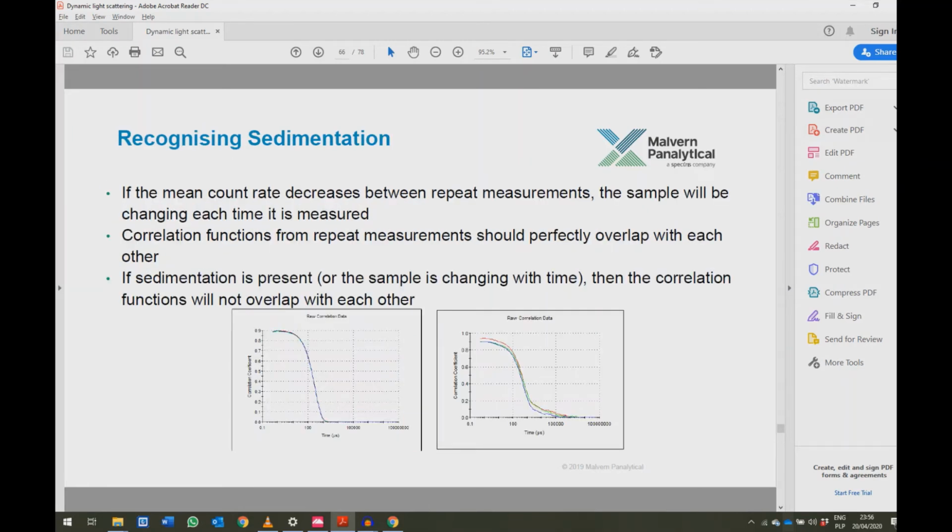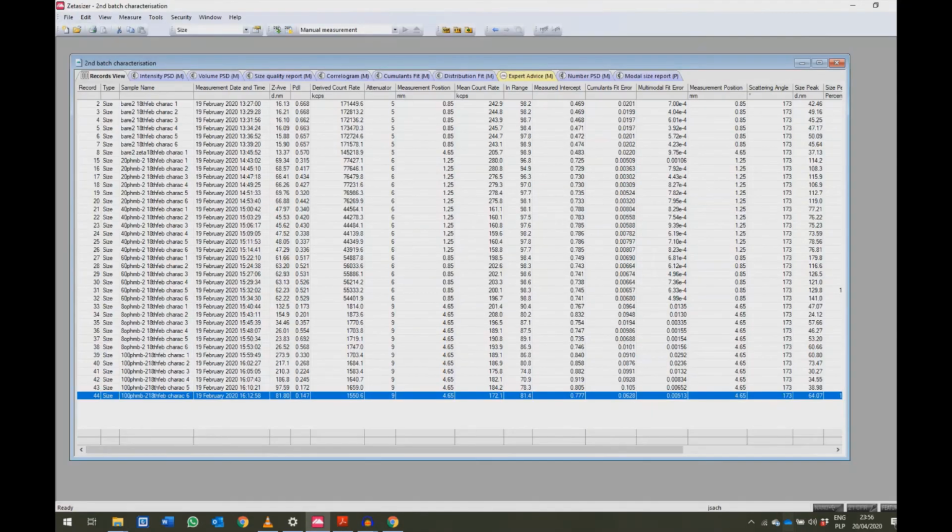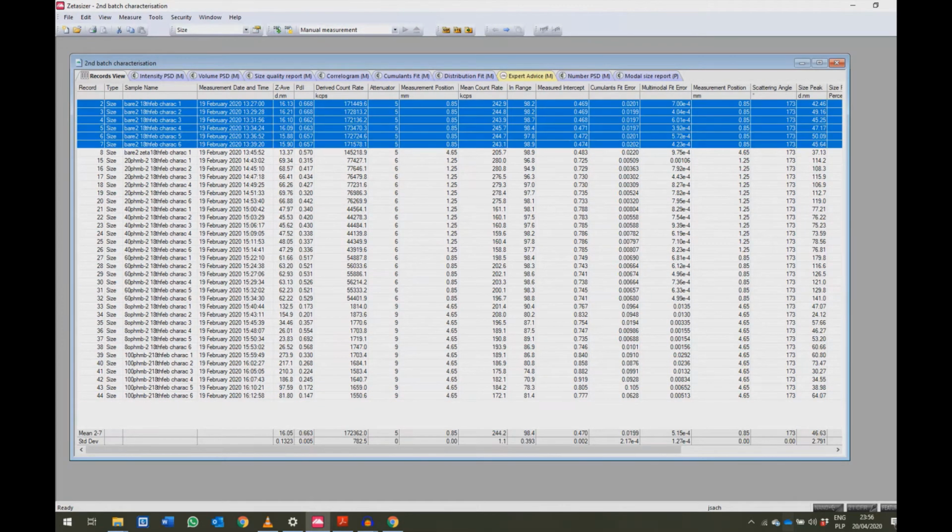And so the first step will be, rather than looking at the sizes of those particles, to look at whether the quality of the data is good. This is the first thing you have to understand, and you have to be able to present in your report where the confidence is coming from that you're able to use the data and it's good quality data.